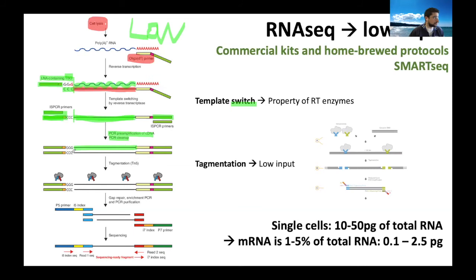Okay, so up to 2-5 kilobases usually. And so it's too long to be sequenced on an Illumina sequencing machine. So what we do is we use this fragmentation approach that I described yesterday to fragment and attach adapters at the same time, okay? So once I do this, I basically have my reverse transcribed double-stranded DNA with the adapters at the end, these blue and the red.